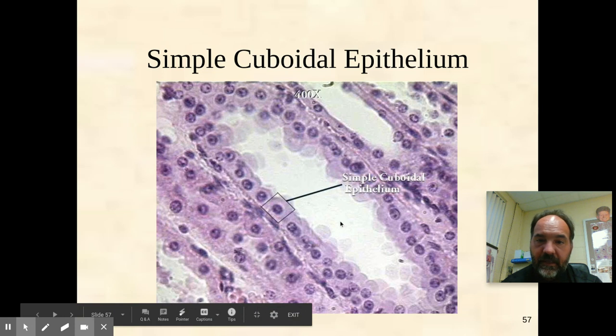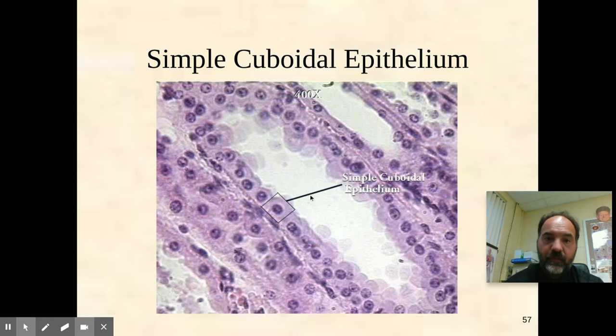This is the lumen, the inside of that tube, and these are one of the collecting tubes in the kidneys where that urine is collected and either water is removed or water is secreted into that urine, depending on your state of hydration and the state of the electrolytes in your blood.